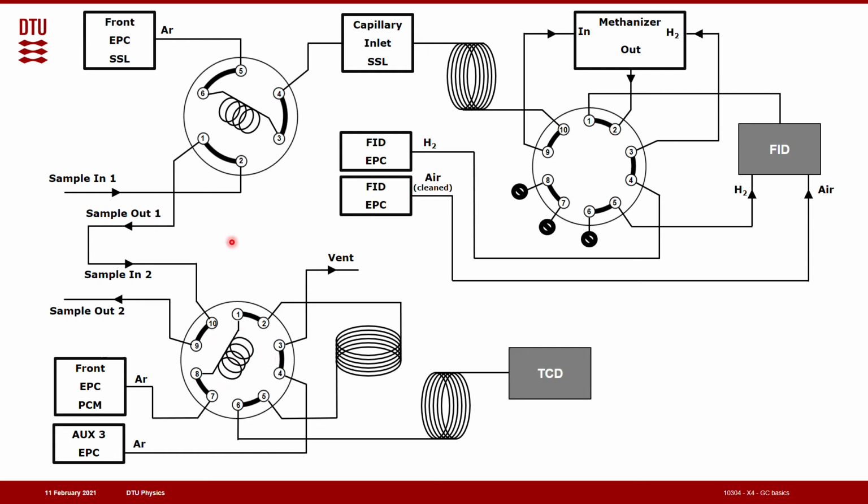And that's a common mistake, to not regard the two timelines as being separate. So we have our time in the GC, the retention time, and then of course we have our experimental time, you could say. We could stop the experiment now if we wanted to. We have taken our sample. It will not change or influence any of the results we get from the rest of this analysis in the GC.